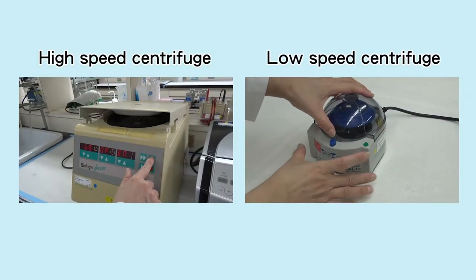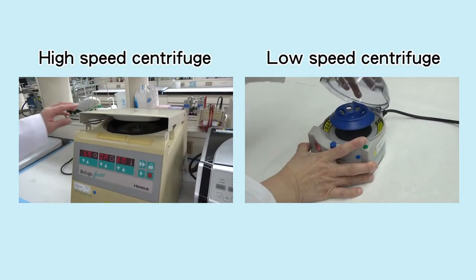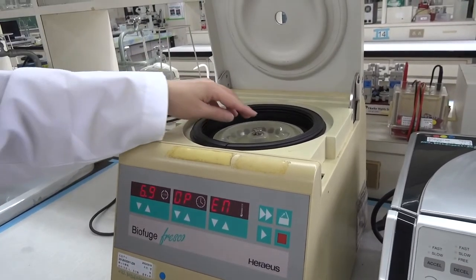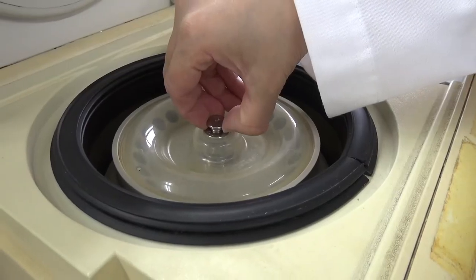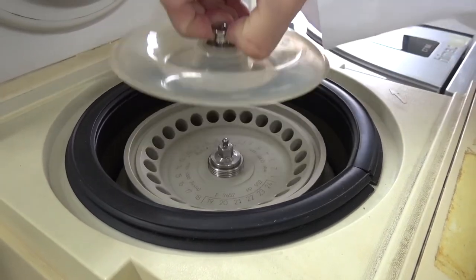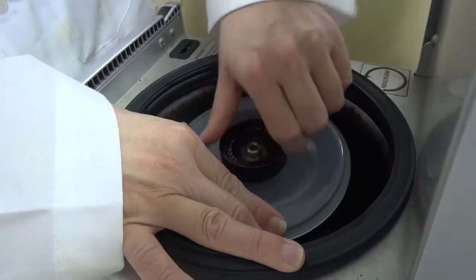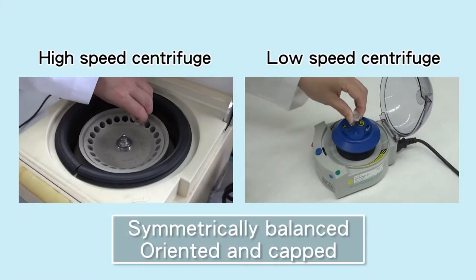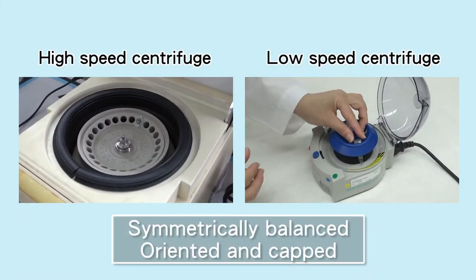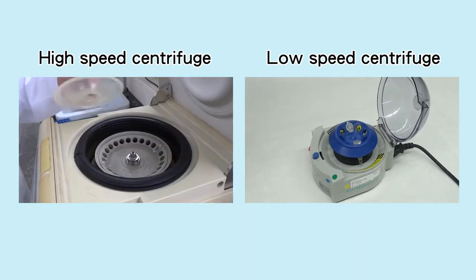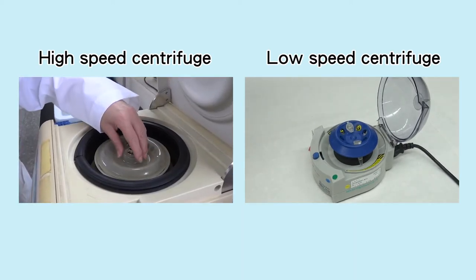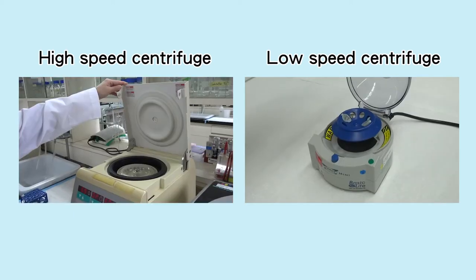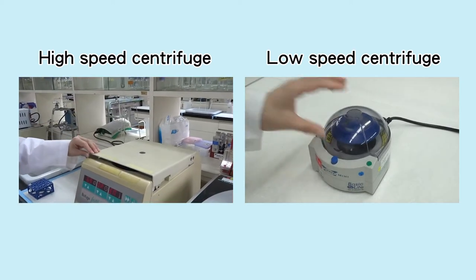After preparation, press the open lid button to open the centrifuge's top lid. If it is a high-speed centrifuge, the rotor's cap must be subsequently opened by pressing the center or rotating the cap, depending on the model. Then place the centrifuge tubes according to the mnemonic. If it is a high-speed centrifuge, the rotor's cap must first be capped on. Lastly, the centrifuge's top lid is closed.